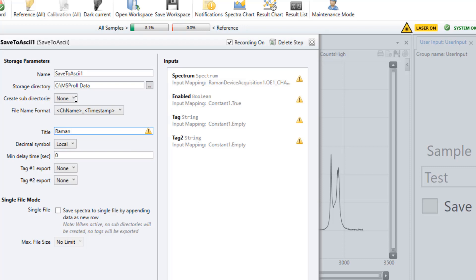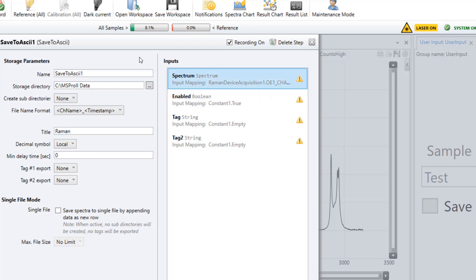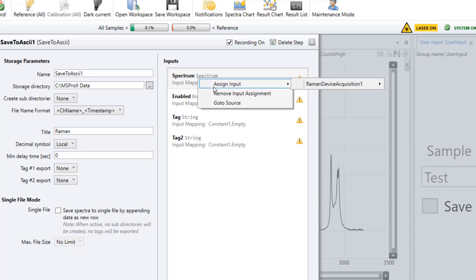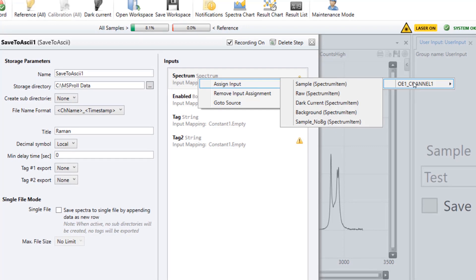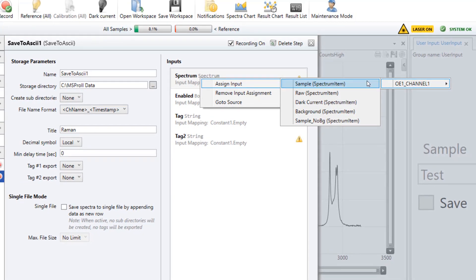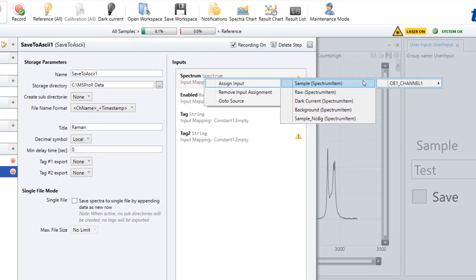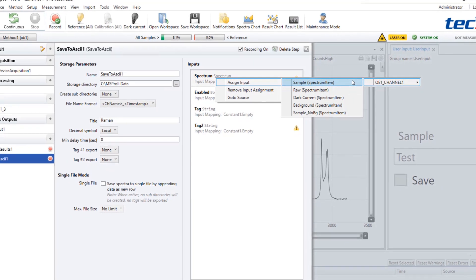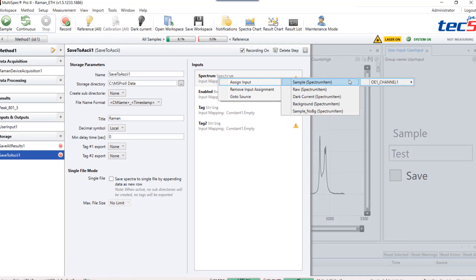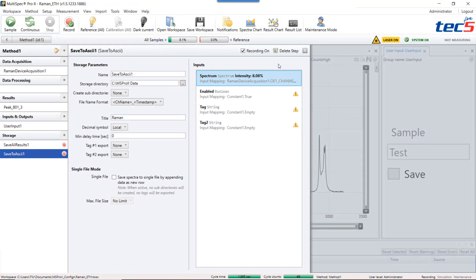In order to select a spectrum do right click to assign an input. Depending on the system's configuration you can select all the spectrum depending on different channels. In our case I use sample spectrum of channel 1. Now Multispec Pro 2 will store a spectrum with each measurement cycle.